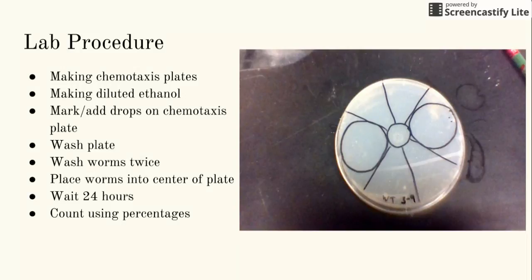Taking a pipette and removing as much water as possible without disturbing the worms. Once most is gone, close the tube and flip it upside down, then tap a few times. The worms will fall into the lid of the tube and can easily be picked up using a regular pipette. Transfer them into the center of the chemiotaxis plate and close the lid, leaving them there for 24 hours, storing them at room temperature.